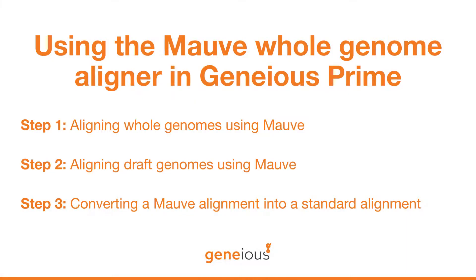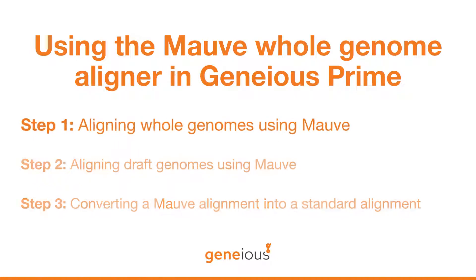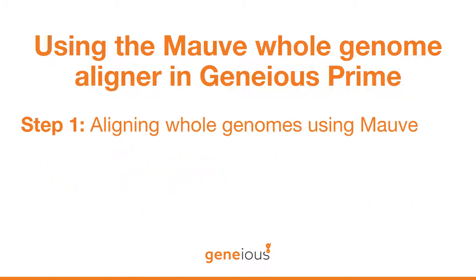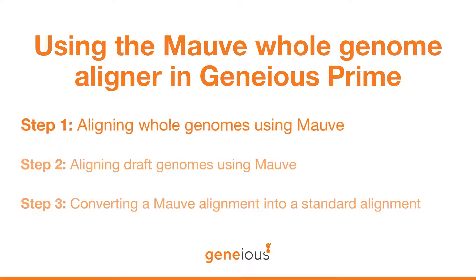This video series covers the use of the MOV Whole Genome Aligner in Genius Prime. In this first video, you will learn to perform a basic alignment of complete bacterial genomes.